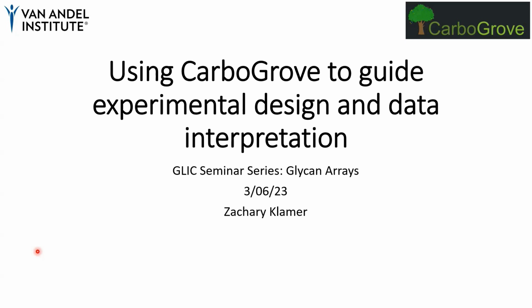And today, Zachary Klamer is going to give a talk about his CarboGrove system. And there we will see that there's also a way that the computer can actually do that for us, at least partially. You will still have to go in and have the final vote on it. But that's what his tool will show. And Zachary is actually working with Brian Harp on that software and his motif finder software that I think he will also show today. So Zachary, please go ahead.